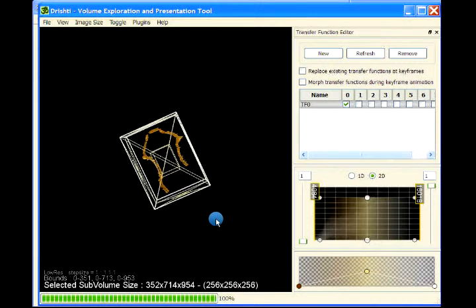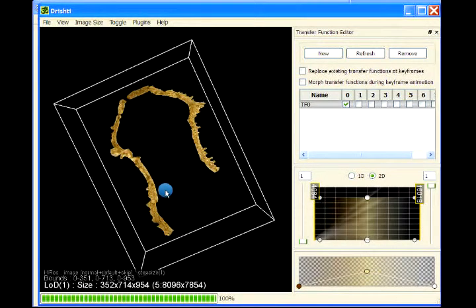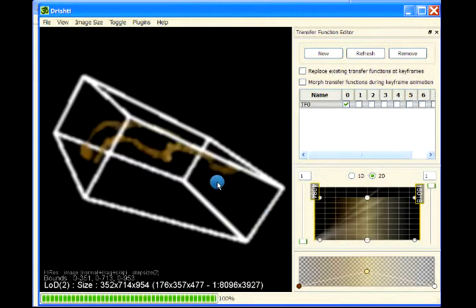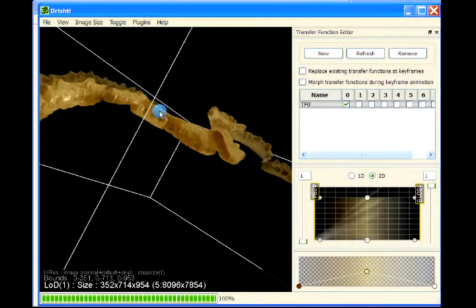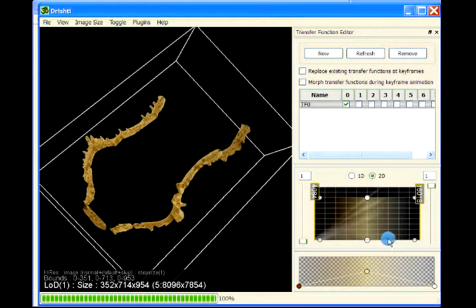Let me just take that here, press F2. And now then you can say make a mesh, or you can then go and find a volume, or you can also apply some smoothing to make it look better.